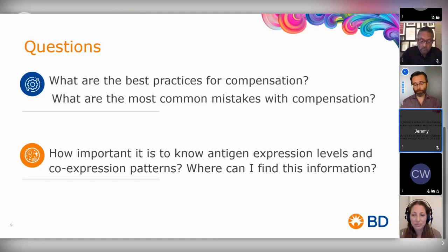We do have issues with tandem dyes, like Yolanda mentioned, because if you think of the way tandem dyes are manufactured, it's very difficult to assure that a tandem dye is always going to have the same exact spectral properties. The spectral properties will change from lot to lot of a tandem dye, and they will change if they're exposed to light, if they're out of the fridge.